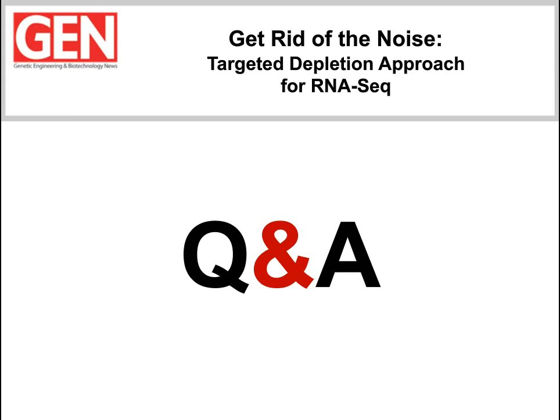All right, guys, looks like we got some really great questions that have rolled in. So let's begin the Q&A session. Our first question is going to be for Ashesh. Ashesh, one of our audience members would like to know, is there a way to, instead of performing targeted depletion, perform targeted enrichment of only certain transcripts of interest?